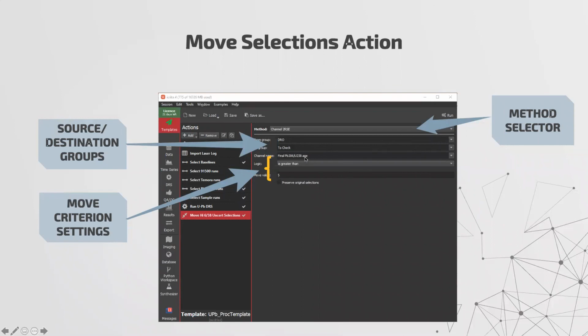And then I want you to move them where the final 638 age has a 2 RSE of greater than 5. So where it has a little bit more uncertainty than normal, put them into this other group and we'll check them. I do have an example where we do that, but I'll skip over it just for time. But it's just an idea, to plant in your head that you can set up your experiments this way.